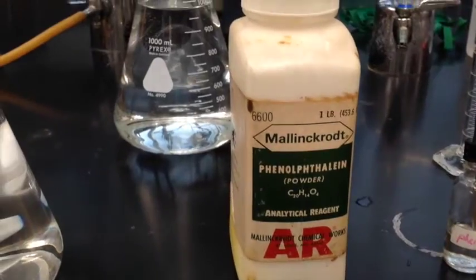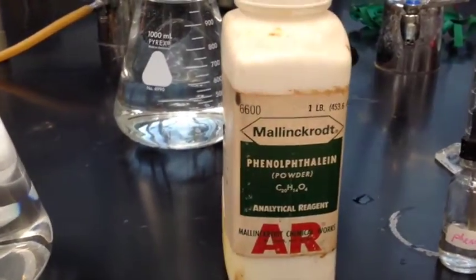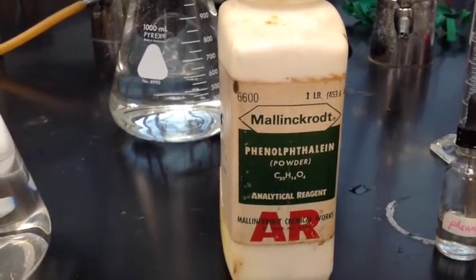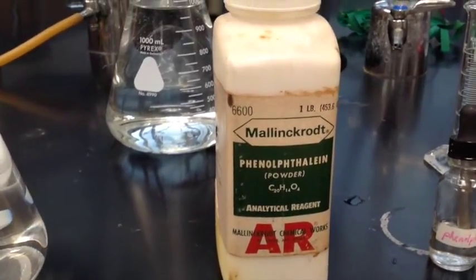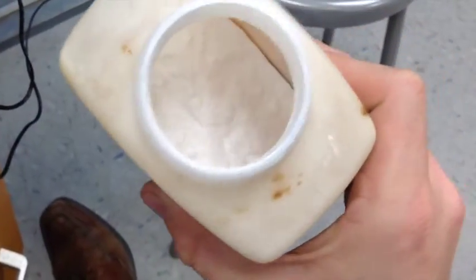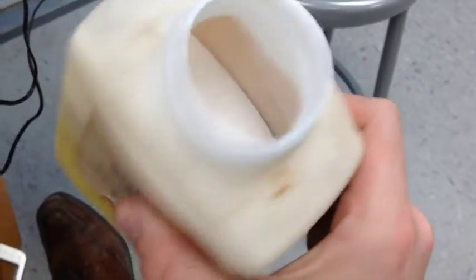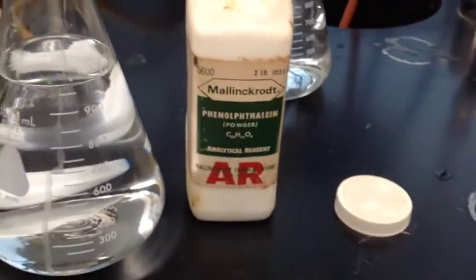Neat. So we need to introduce another character. It's someone we've worked with before, but probably a little more important now to us, and that's called phenolphthalein, that big word there. And it's a white powder. Here for a second, let me open that up. You can see phenolphthalein is just a white powder. It's very dusty, almost looks like baking soda consistency. It's actually pretty easy to make. It has this kind of sweet, almost sarsaparilla smell to it. It's very pleasant.